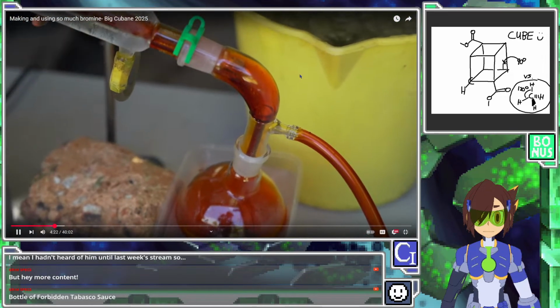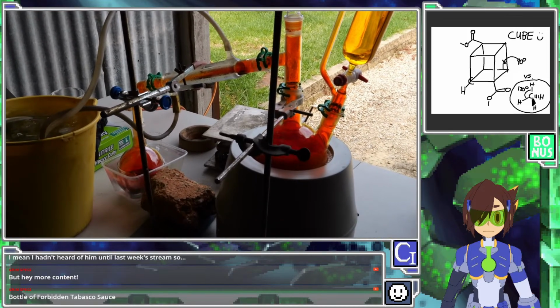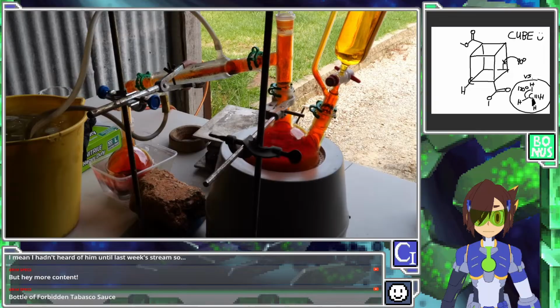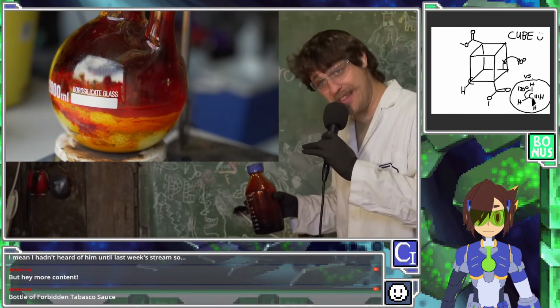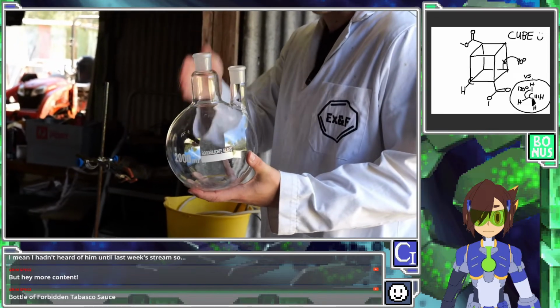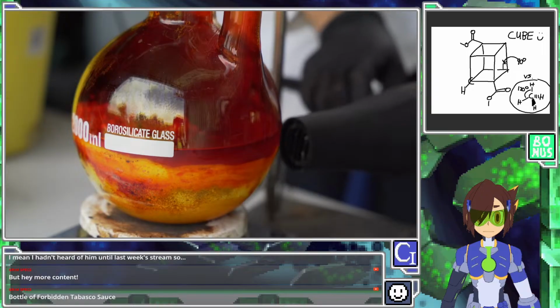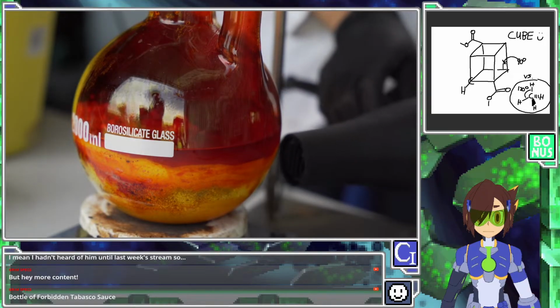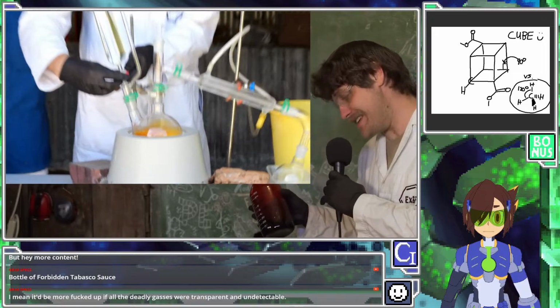Kilos of sodium bromide. It was a bit of a task, I've got to say. We spent all day distilling bromine, first in the 1 liter flasks on a smaller scale, and then we moved up to the 2 liter flask. What is this? Why are you shaped like that? I don't know. And we were running a 2 liter flask at the same time as a 1 liter flask to try and produce enough bromine and get up to the 1 liter mark within the day.